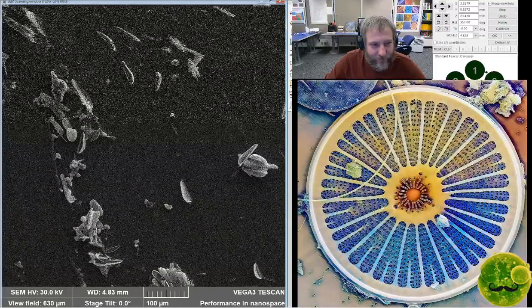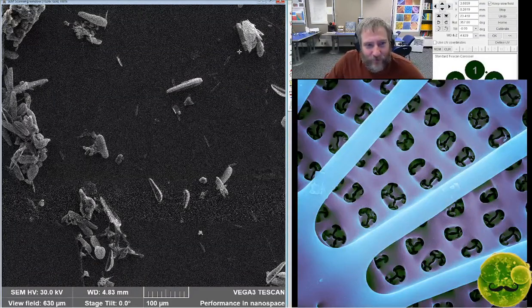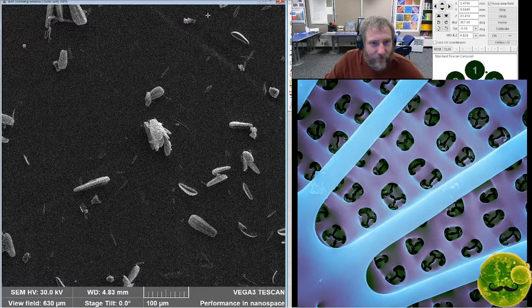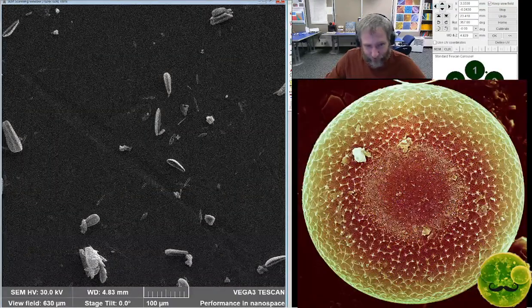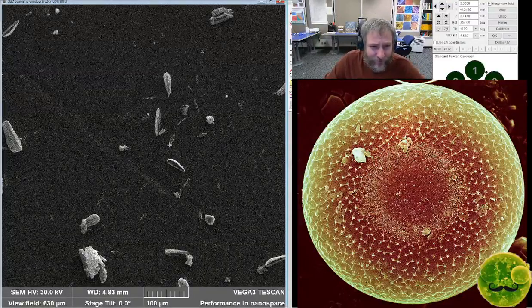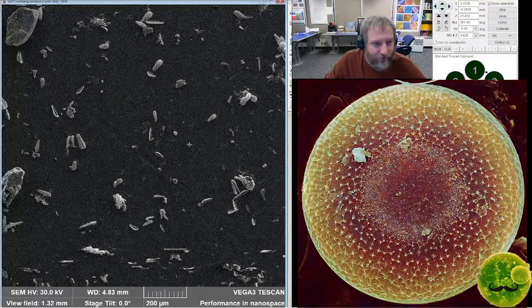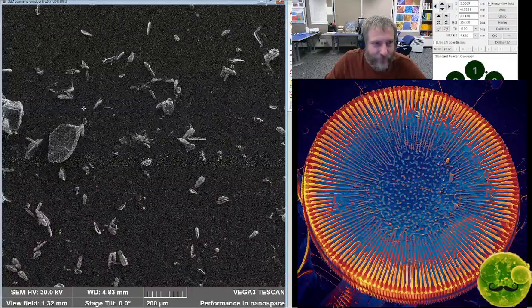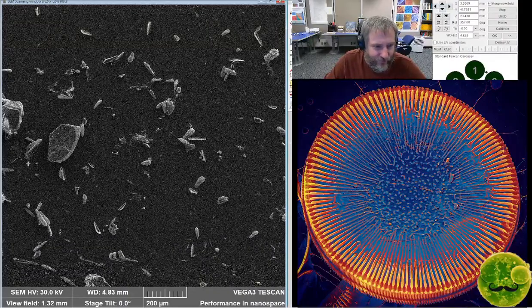Unless this is a Tanganyika or some other Afrocymbella, it's quite common in this. The nice thing about external view and internal view is you can tell from a distance whether it's internal or external. Internal views look like little rubber bands. They just look like a white ring around. And so I don't have to zoom in every time. I can kind of look around. The external views are very bright. They have a very bright surface.